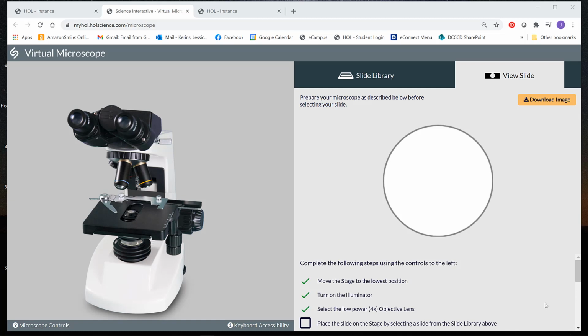Before we get started, I just want to say that this short lecture is specifically meant for biology for non-science majors at Eastfield, and even more specifically for the section that is taking this class completely online and using a lab kit. So what you're seeing on the screen right now is the virtual microscope program that we're using as part of this lab kit.